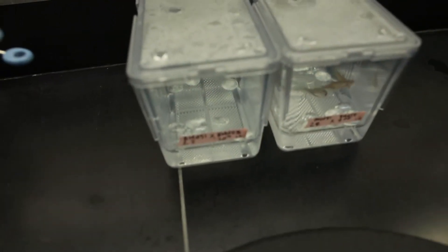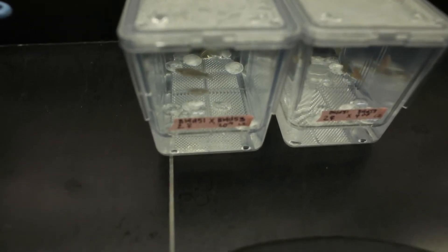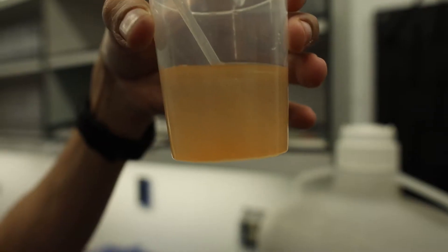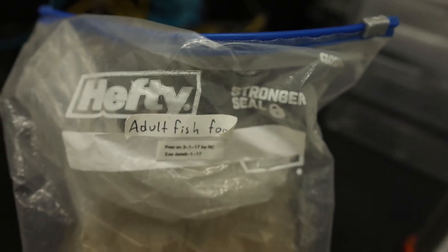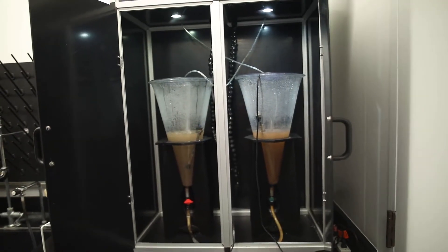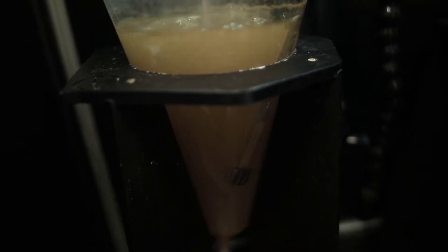Most of the fish you see here are set up in mating tanks to produce embryos and larvae for experiments or classroom activities. To set up crosses, we have around 50 breeding tanks and we use this counter space in the main aquarium room. The feeding schedule is twice a day and once on the weekends. We feed them a perici mix and brine shrimp. A brine shrimp hatchery is set up in the aquarium room, and they are collected with a pipette and transferred from salt water to fresh water.